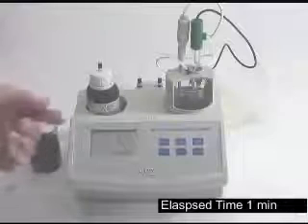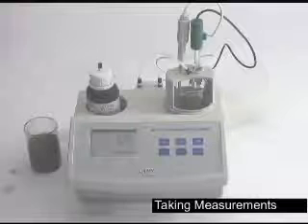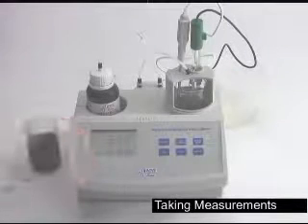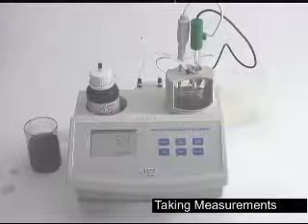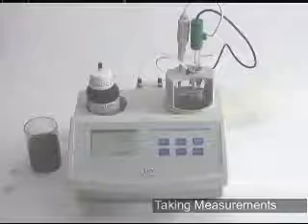Machine is done. Now you see the results, 5.4 grams per liter of total acidity for this wine. If you're used to grams per 100 milliliters, just move the decimal point one place. This would be 0.54. That's it for running a total acidity test on the 84102 from Hanna Instruments.